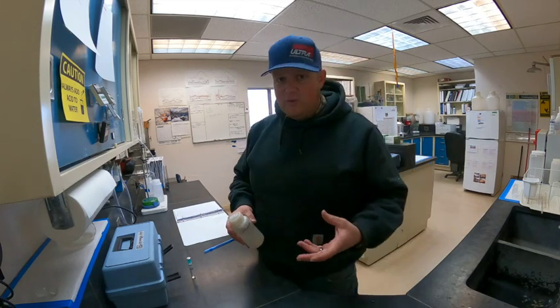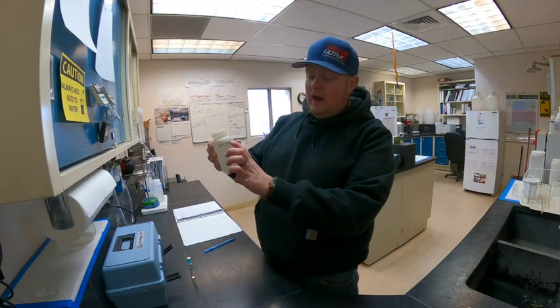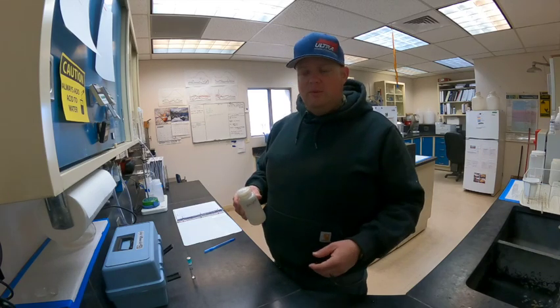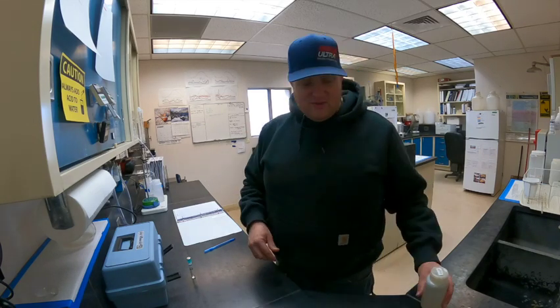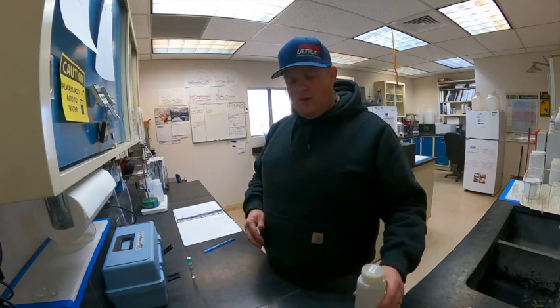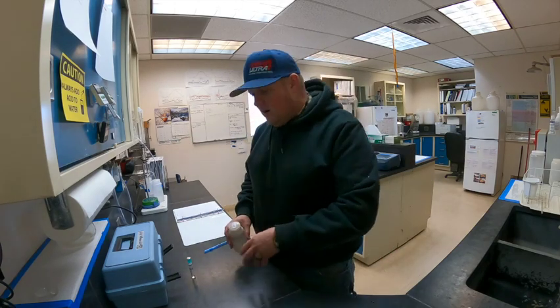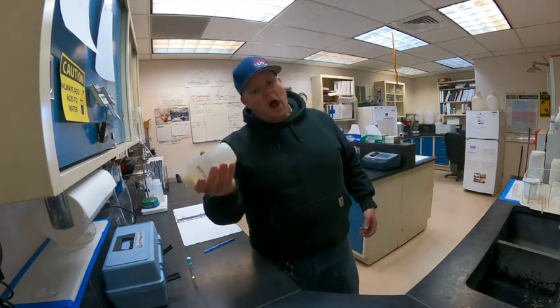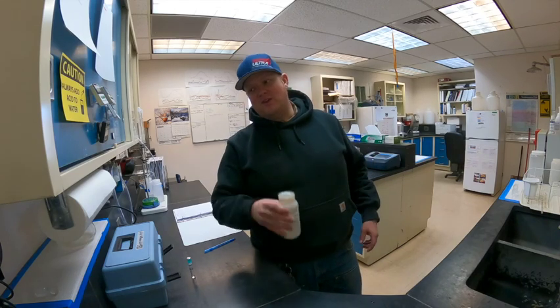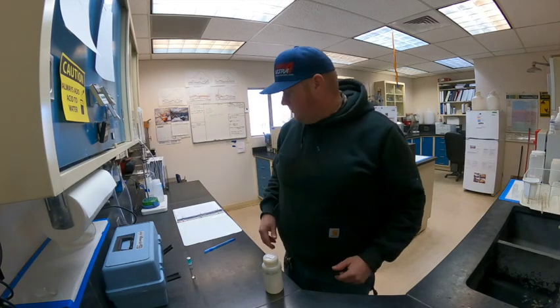However, it's not always nice, clear effluent such as this. We'll do a lot of RAS, return activated sludge samples, and digester sludge samples, so you have a bottle like this, but it's full of brown chocolate milky goop. I've done this before, and it's not fun at all because it's a giant mess and takes a lot to clean up after. You're running through a bunch of samples, you grab your bottle, you're ready for the next sample, and guess what? Your lid's not on tight, so when you go like this, you shoot brown juice all over the place, and it makes a giant mess.